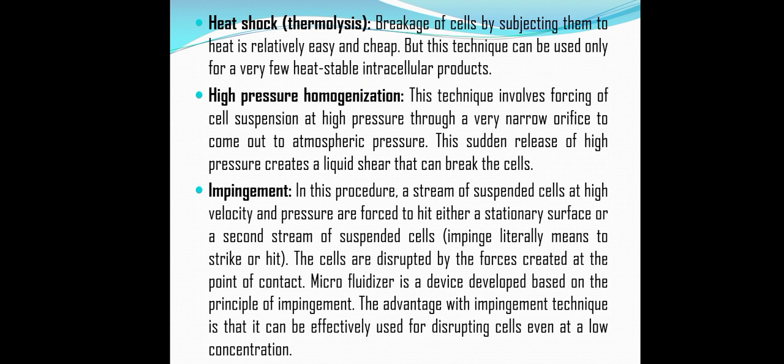Now this technique involves forcing the cell suspension at high pressure through a very narrow orifice to come out at atmospheric pressure. It means there is a transfer of the cells at high pressure through a small orifice, and this sudden release of the high pressure creates a liquid shear that can break the microbial cells. Due to the application of pressure, there is a disruption of the cells.